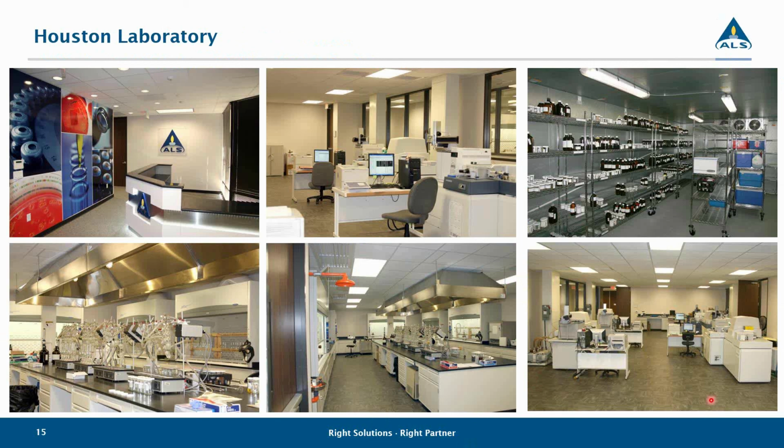Great. We have a question from Toby. What is the quickest turnaround time for a soil or sludge sample and the corresponding cost above normal turnaround time? Yes, for a soil or sludge sample, normally the fastest turnaround time is 4 to 5 business days, and we charge a 50% surcharge for that rush turnaround time analysis. And just to expand, the price really depends on how many samples are in your project and some of your reporting requirements and that sort of thing. But a basic price for one sample would be around $425.